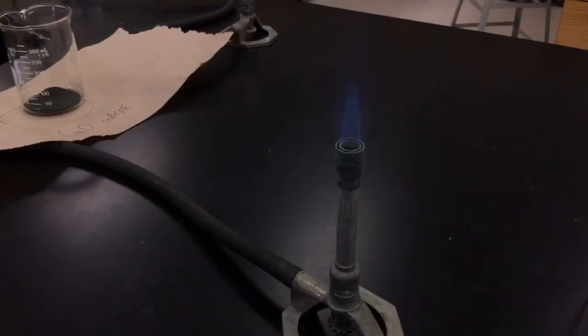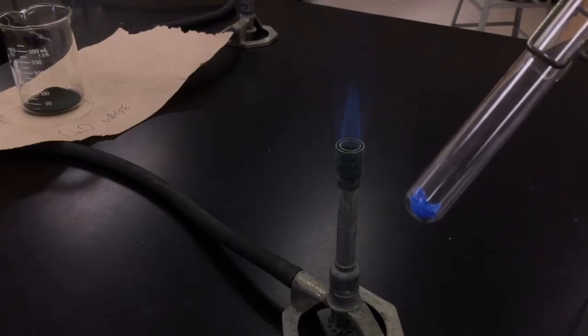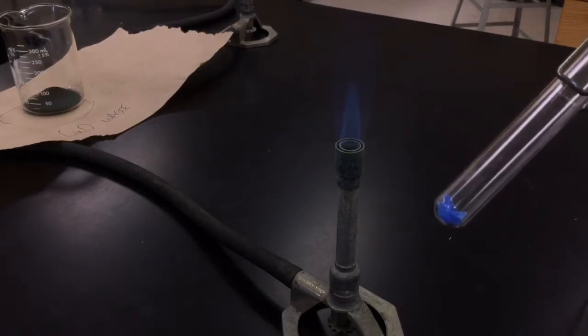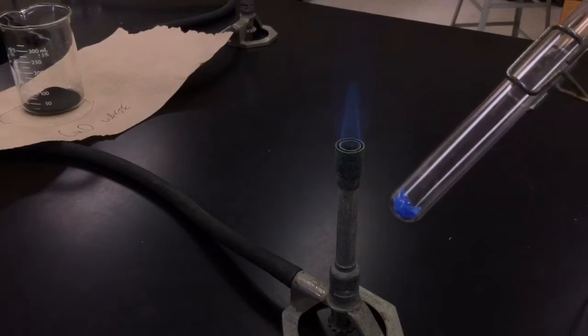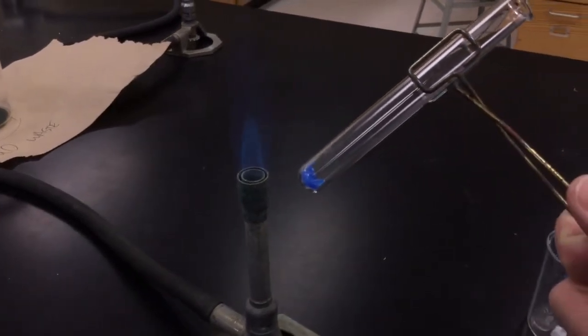Alright, so I've got my Bunsen burner lit and I've got my test tube with my blue vitriol in it. And what we're going to do is heat this up in the Bunsen burner. Again, we're going to point the mouth of the test tube away from anyone because some hot steam is going to be coming out. We're going to hope to kind of show that in our picture.